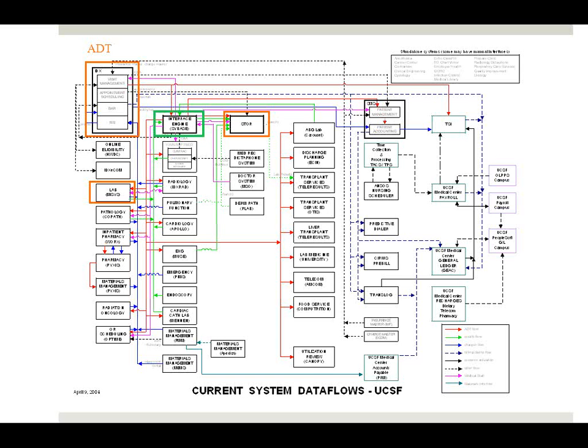So these kinds of systems now become extremely dependent on your network hardiness, your infrastructure, and how redundant it is. As long as I can keep the network up, I'm okay. But if the network goes down for any reason, or portions of it that are critical go down, or the interface engine goes down, then the whole thing grinds to a halt.